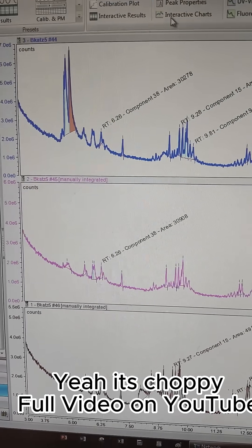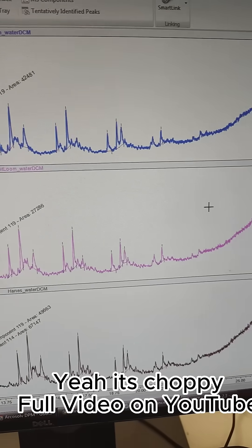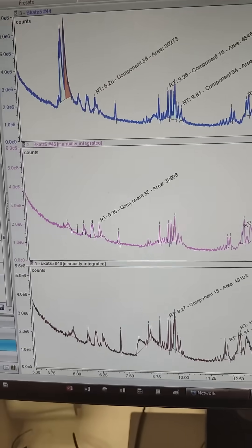I really like the Gildan, so that's a bummer. Looking at the Fruit of the Loom, it's really clean - not seeing any residual solvents.